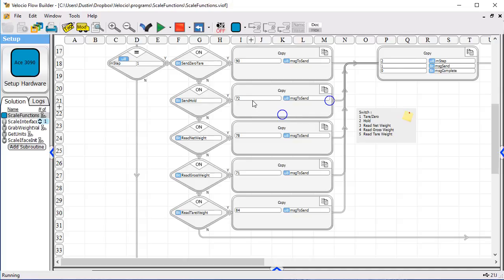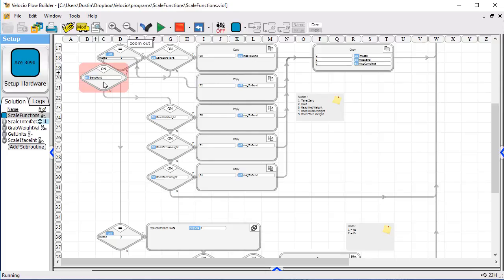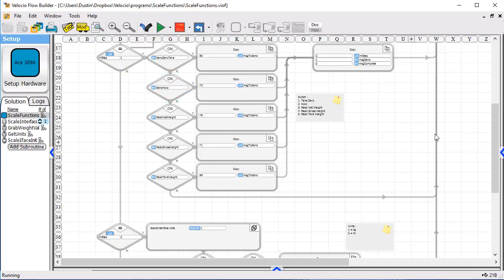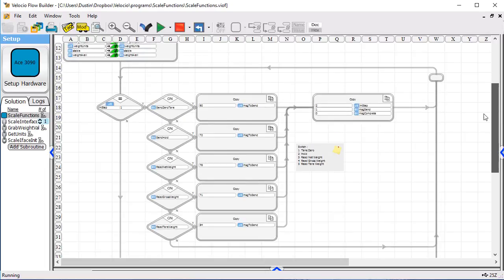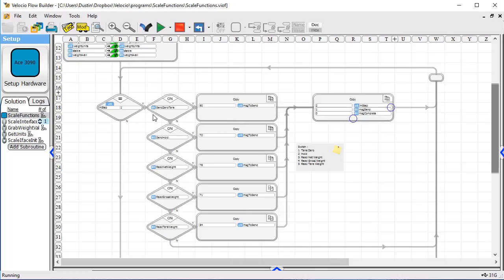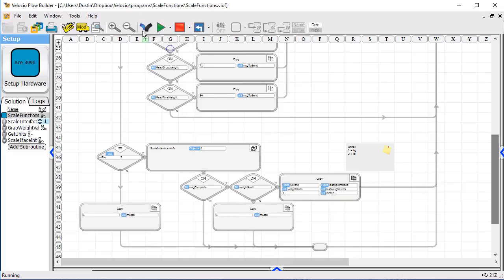So normally when we're sitting here, nothing's been flipped. We're simply going to be going around a loop, we'll back out a little bit here, and we'll just be going around this loop where we're waiting for a switch to be flipped. Once it's flipped, we've selected the message and we go down to the second step.